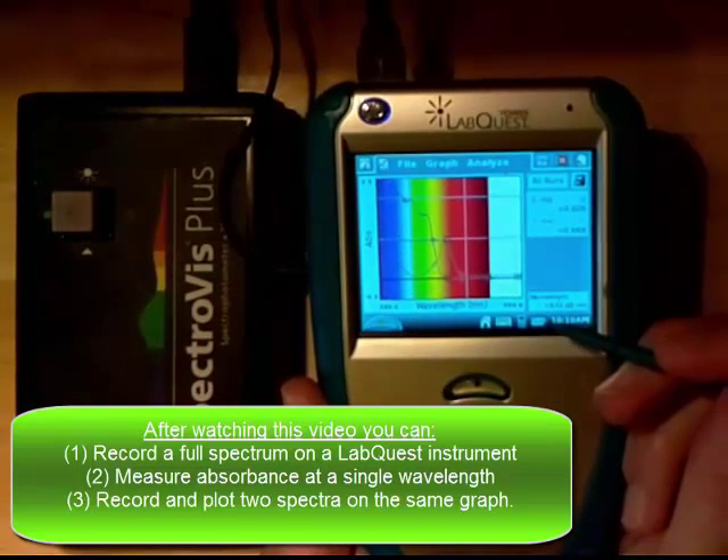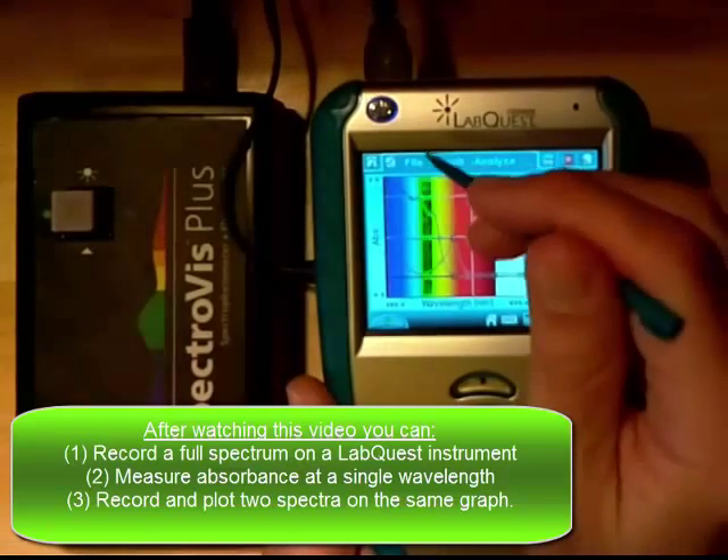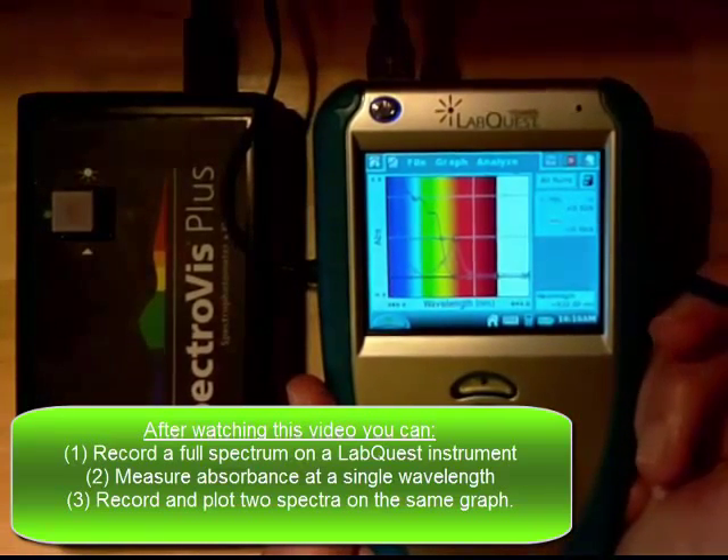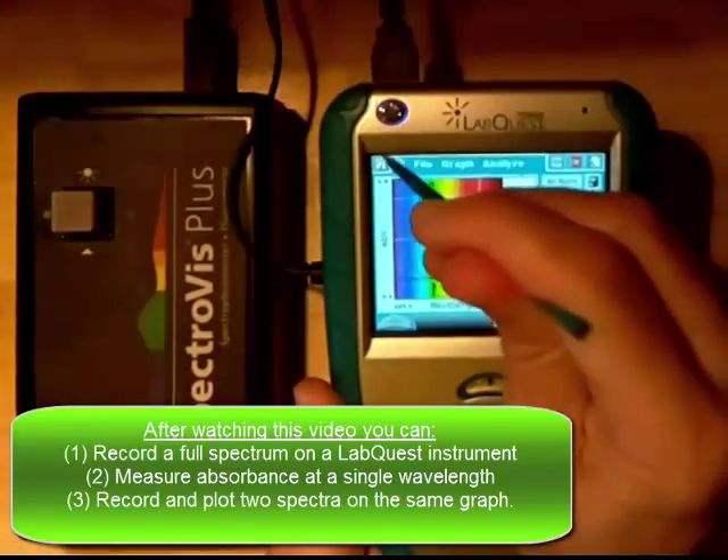So that's a brief introduction to how to use the Vernier LabQuest with the Spectravis — covering full spectrum mode and time-based analysis mode.